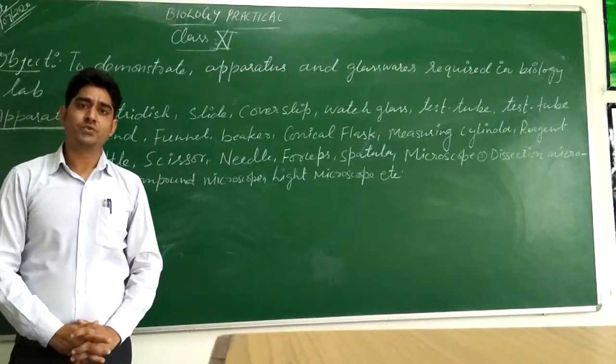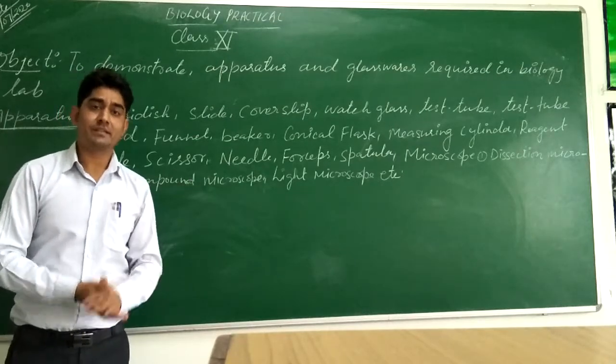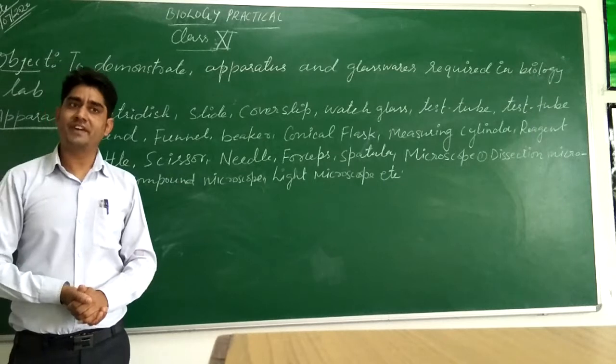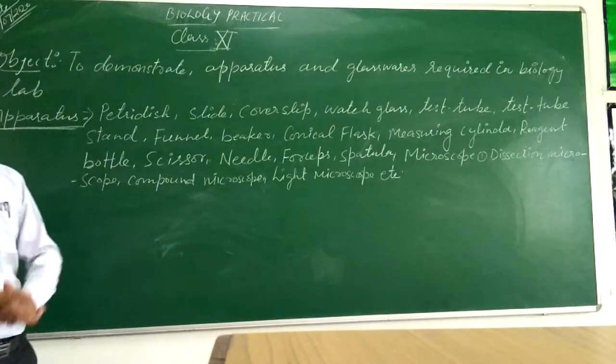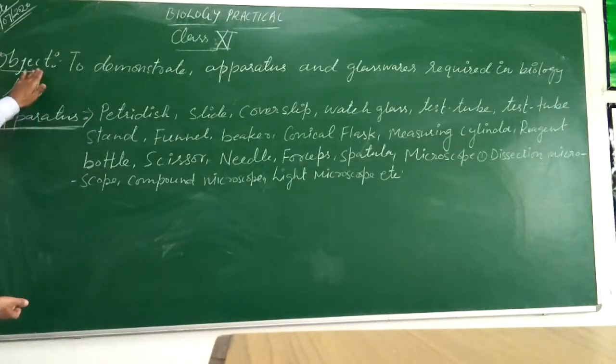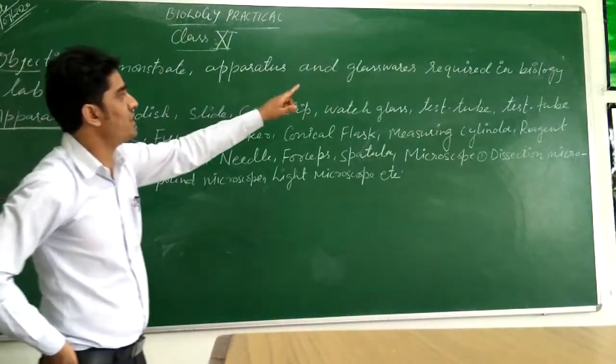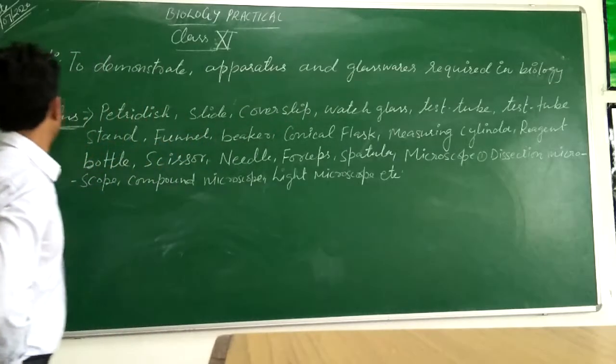Students, today we are going to demonstrate the biological apparatus which are very essential for biology practical. Now let's look here at the blackboard. Today's practical object is to demonstrate apparatus and glassware which is required in the biology lab.